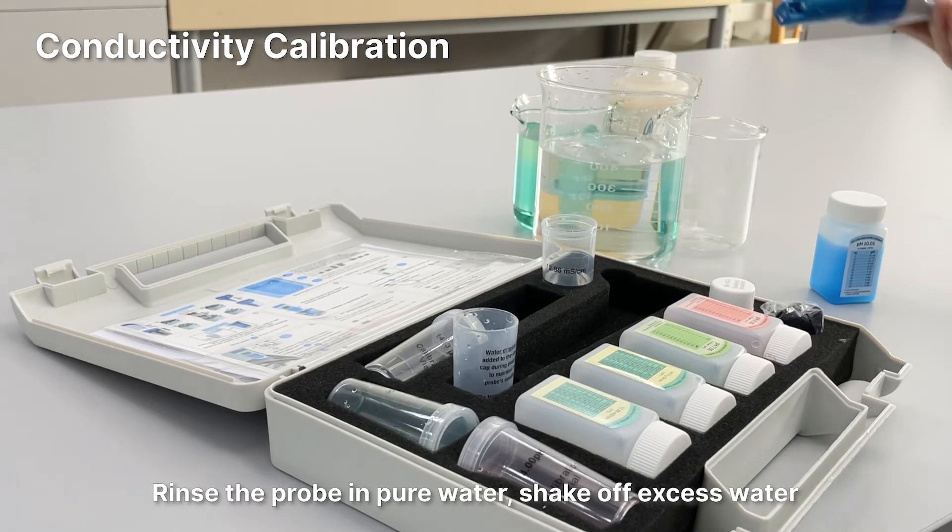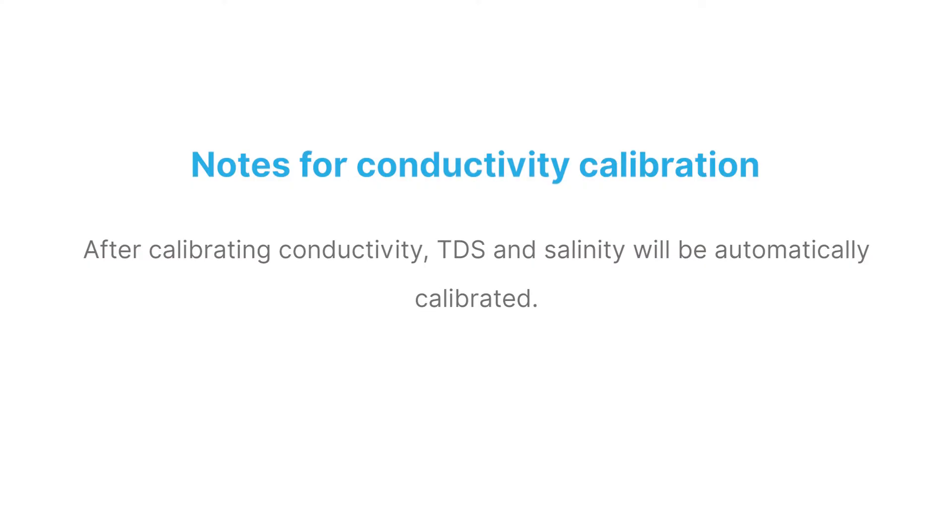Rinse the probe in pure water and shake off excess water. Notice for conductivity calibration: after calibrating conductivity, TDS and salinity will be automatically calibrated.